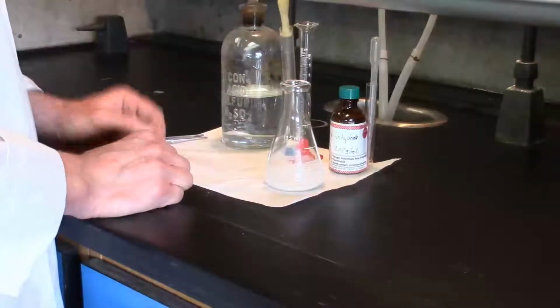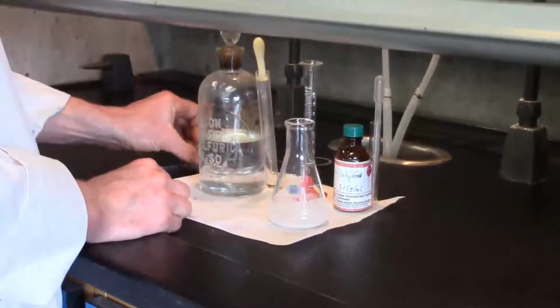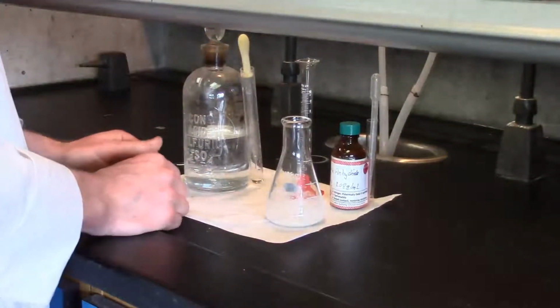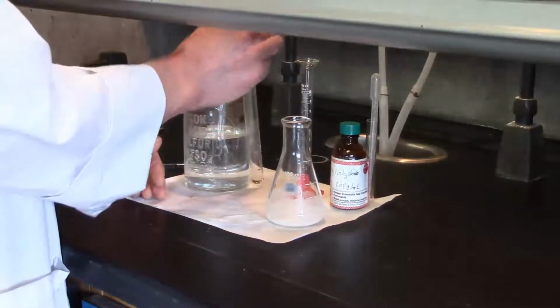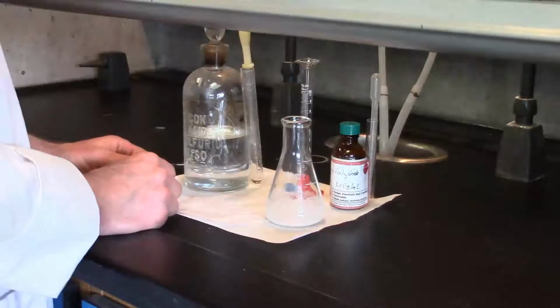Now I add the catalyst, the sulfuric acid. This is concentrated sulfuric acid. If you get any on your skin, immediately go over to the sink and flush with water. But of course, if you handle this very carefully, there should be no reason to get it on your skin.